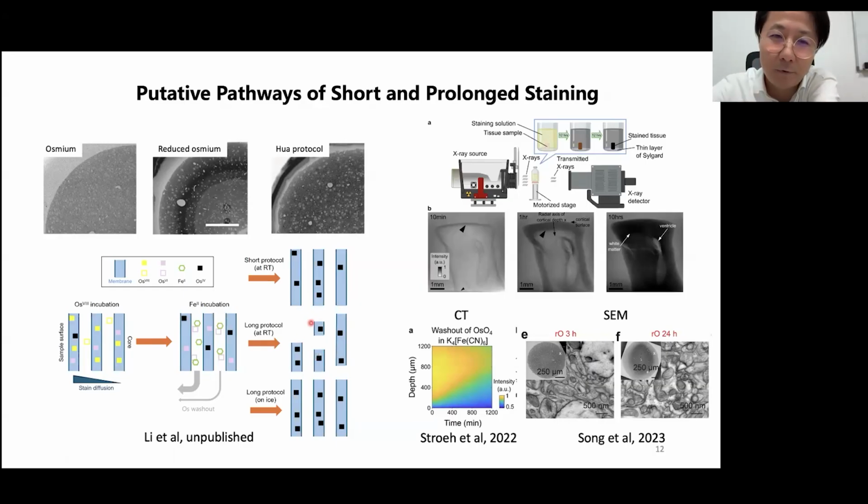Therefore, you have a lot of membrane breakage, and material will also be extracted from the sample. Therefore, if you don't have any structure anymore, or the osmium is reduced and previously stained the membrane bilayer, it will be washed out. And this is also observed in this kind of sample. The membrane structure is terrible, and you will also have a lot of extraction from the cellular structure.